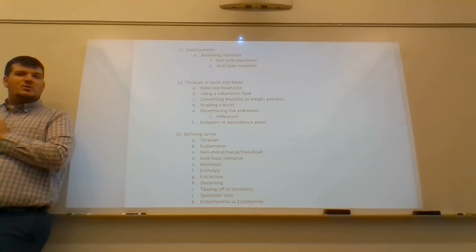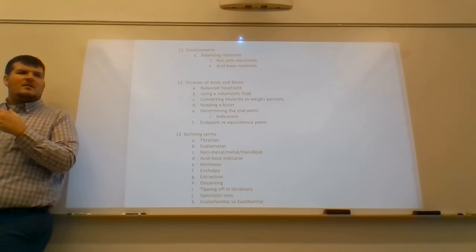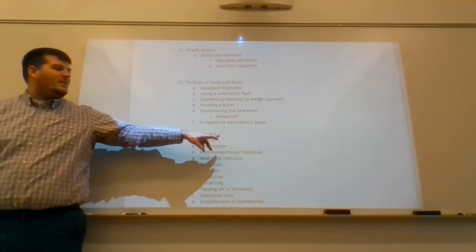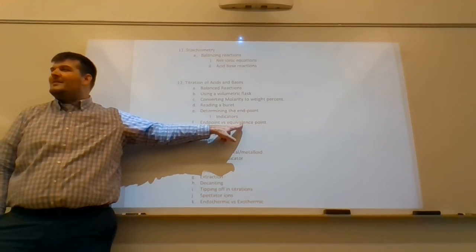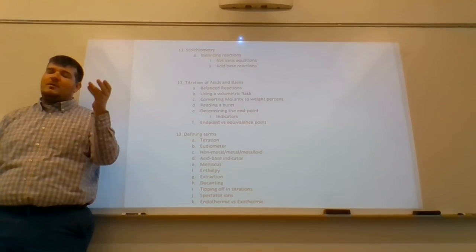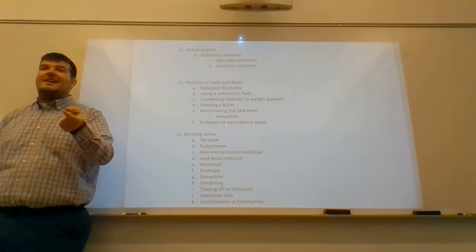Now, I just told you that phenolphthalein turns colors at 8 point something or 9 point something. Where do you guys usually think of an equivalence point taking place? pH of 7. When moles of acid equals moles of base, normally you say, okay, well then the pH will be 7, it will be neutral. That's not necessarily true. We used oxalic acid.